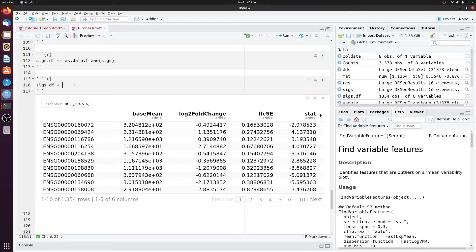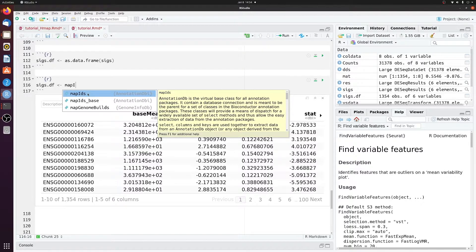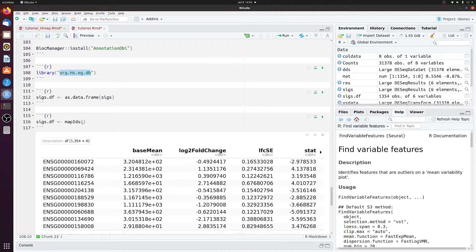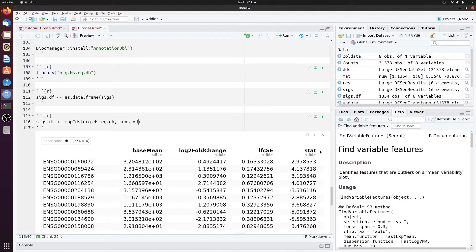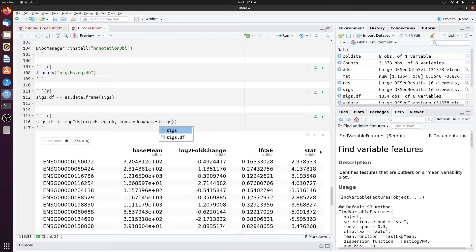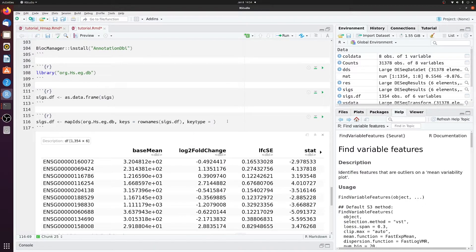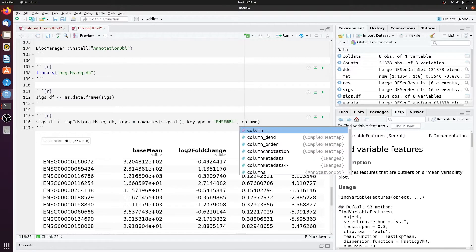And now we can just call mapIDs. This is where we point to our database. Our keys are going to be the row names of SIGsDF. Our key type is going to be ENSEMBL, and what we want in return is going to be symbol.